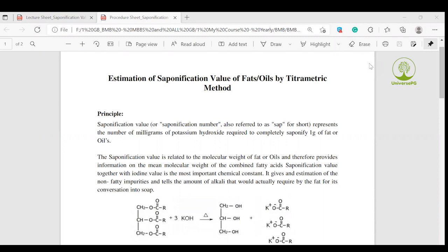This experiment is titled Estimation of Saponification Value of Oil or Fat by Titrimetric Method.